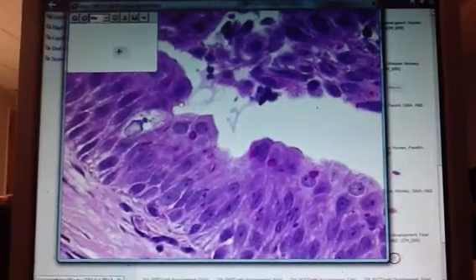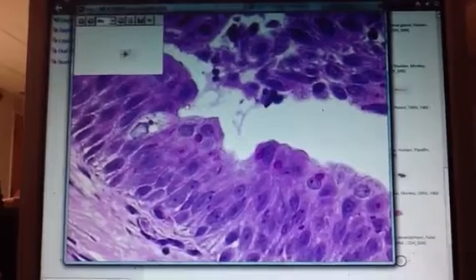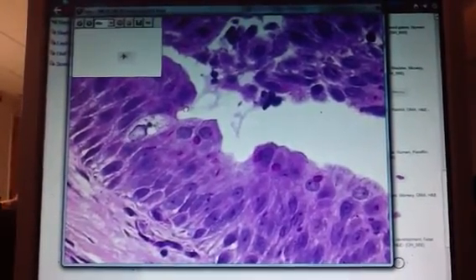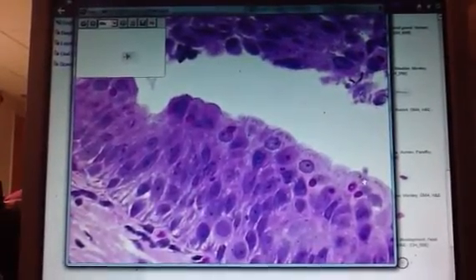Okay, so let's take a few minutes, and you look through the examples of these on your own. I'll come back in about 20 minutes and do the glandular epithelium. So make as much headway as you can on these, and then we'll do glands in just a moment.